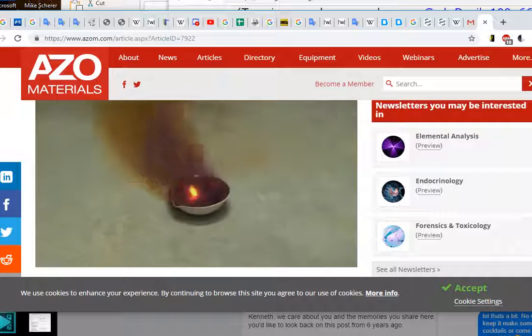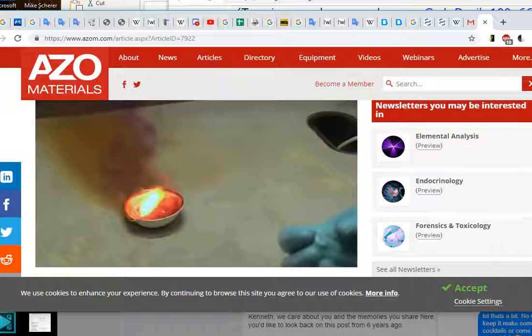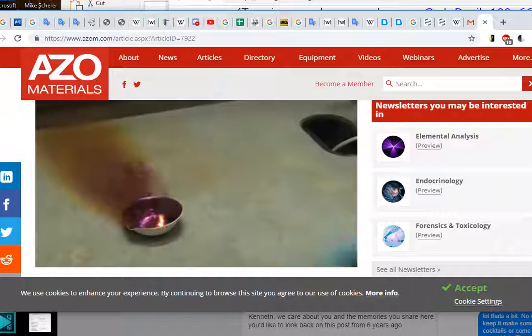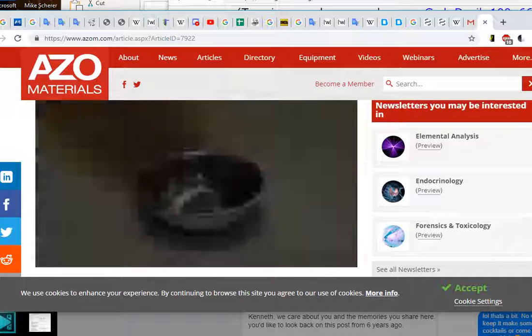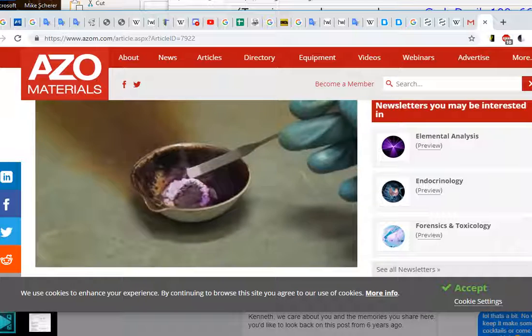Now deep inside the reaction you can see the exothermic, or the energy coming out, starting to cause a flame. Really, really nice, very, very rapid chemical reaction. Really beautiful. So we're forming aluminium triiodide here, which again is a very, very delicate compound, quite reactive in itself. But you can see now the really nice new crystalline material.